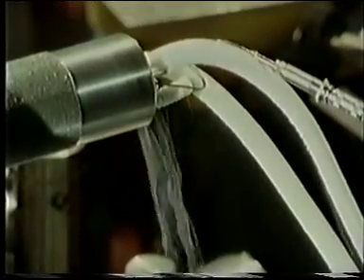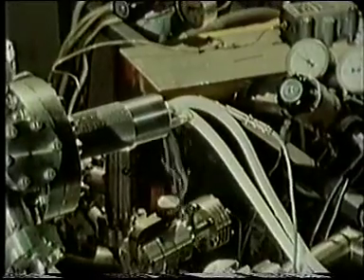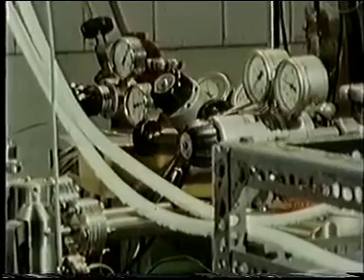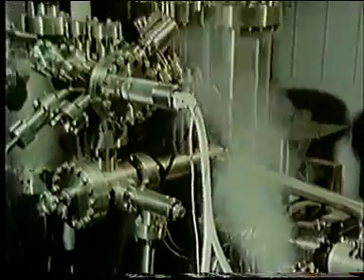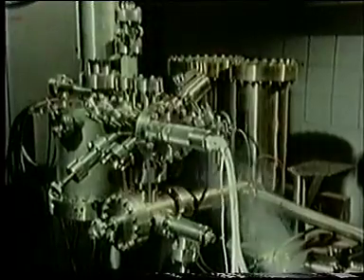Our first spectrum will be run at low temperatures, so we cool the sample to 100 degrees Kelvin. Next, it's exposed to a very low pressure of nitrogen gas, about 10 to the minus 9 atmospheres. After the exposure, the ultra-high vacuum is restored, and we're ready to run the spectrum of the adsorbed nitrogen.